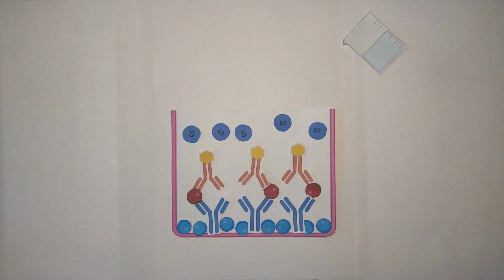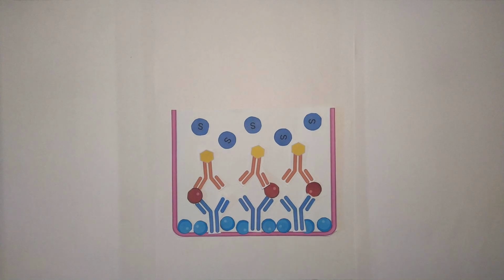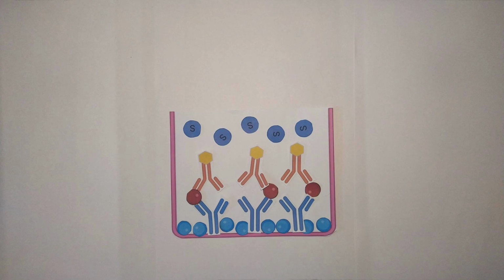After this, stop solution is added, which stops the reaction, thus preventing non-specific coloring. We use H2SO4 as a stop solution. This is how sandwich ELISA is performed.